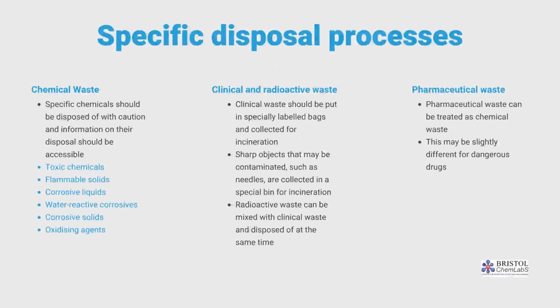Clinical and radioactive waste should be put in a specially labeled bag and collected for incineration. Sharp objects that may be contaminated, such as needles, are collected in a special bin for incineration. Pharmaceutical waste can be treated as chemical waste. This may be slightly different for dangerous drugs.